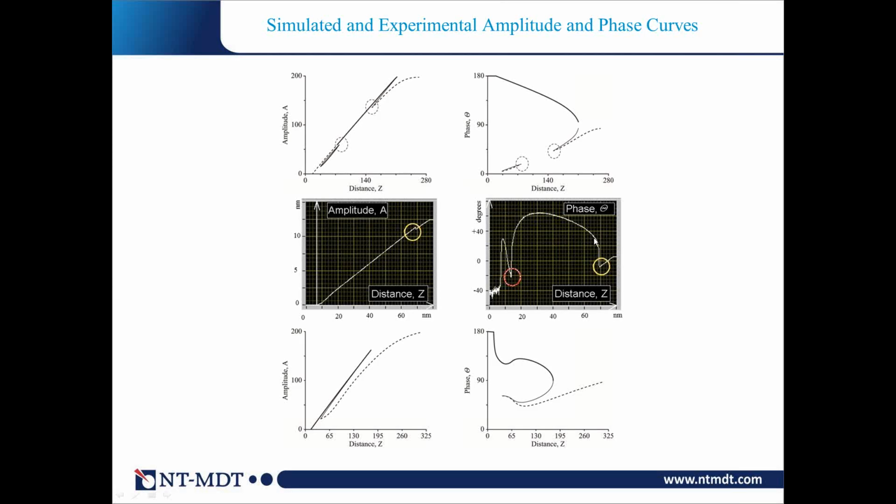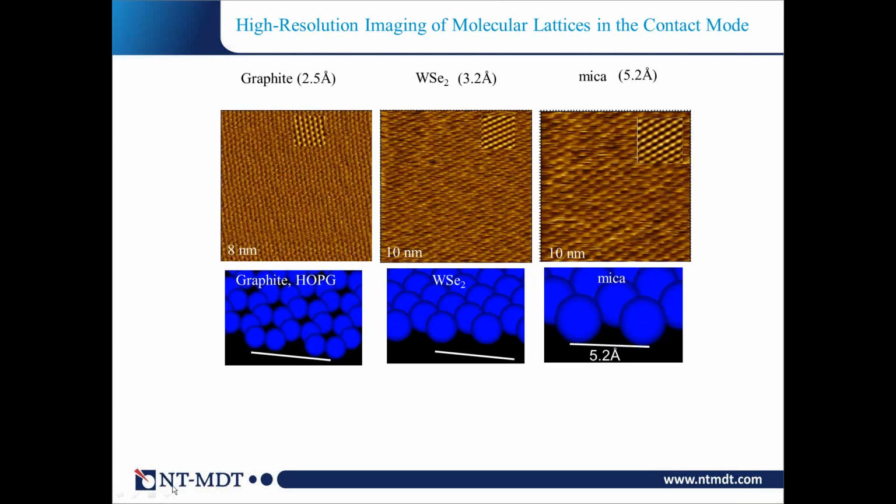here we have the large amplitude branch, and then this is the small amplitude branch, typically attractive force interactions. That means we can learn a lot from that about our behavior and also gain understanding of the things which we see in our experimental data. Now I will go to high resolution imaging. Here we also get help from the simulation, and I will show you how.